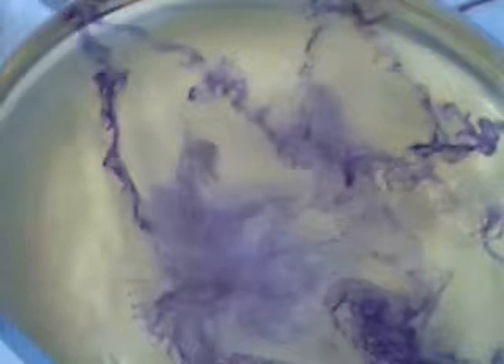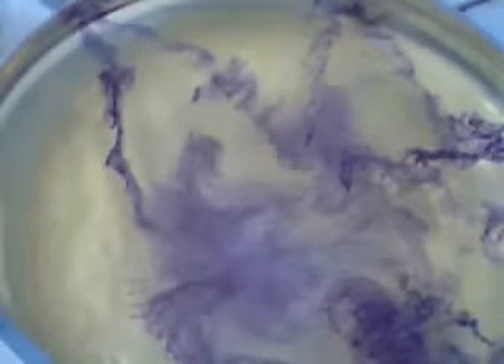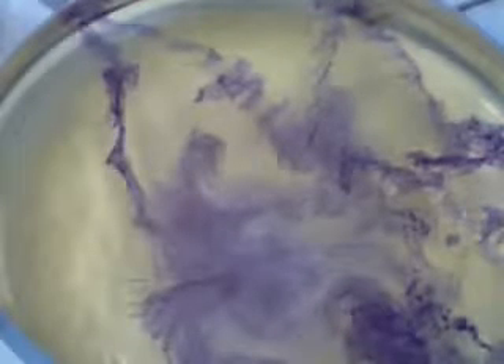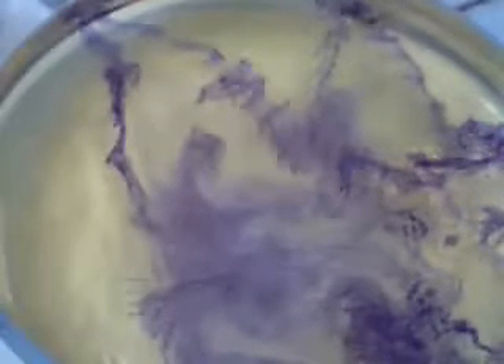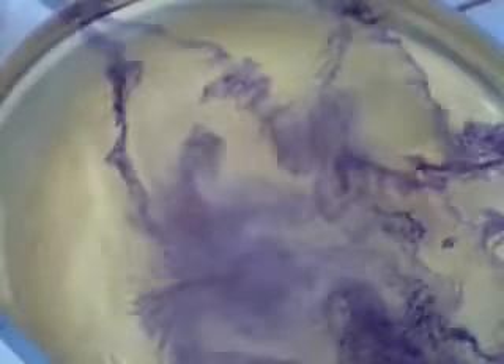And then just at the end — well, this one is actually quite nice, because it just fizzled out. That almost never happens. I hope you appreciate that, because normally what happens is it explodes a little bit, and you have to be quite careful.